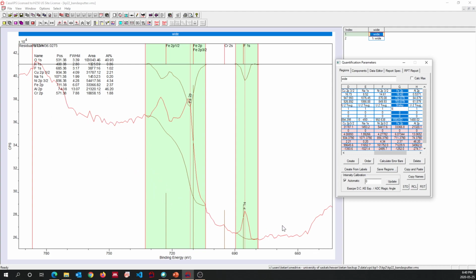You see, all of my data is going up here, and if I use the flat background like the horizontal line as a background, it's going to be totally wrong. So I need to accommodate that background noise, and I think for my sample this is fine. If you want, you can change the background type to U2, or you can use a linear background.